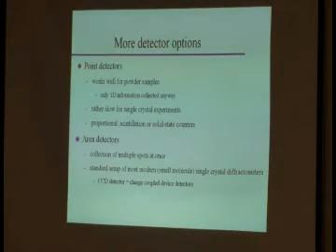There are 3 types of point detectors. Proportional is where gas atoms are ionized, and that is basically detected. Scintillation basically works through a fluorescence mechanism, then you have a photomultiplier. And then you have the solid state counters, which are actually very neat detectors. The solid state counter is a semiconductor based counter. What that one can do is, it can not only detect when X-rays hit, it can also discriminate energy.